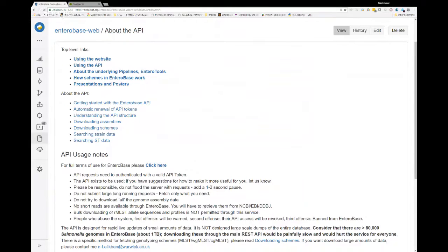But as Martin showed, editing metadata can be done fairly easily by modifying the records in a tab delimited file, and then you can upload that to the web page pretty easily. So you can do bulk changes pretty fast on the website itself.